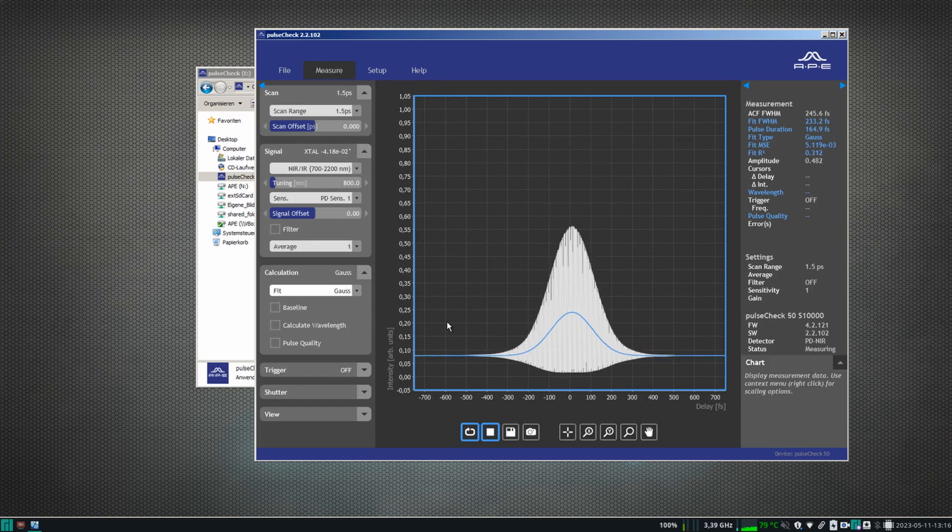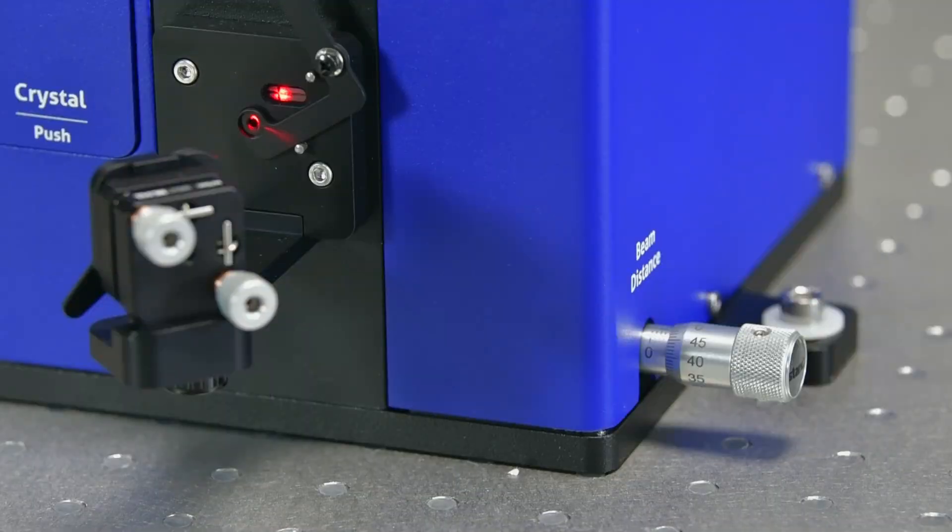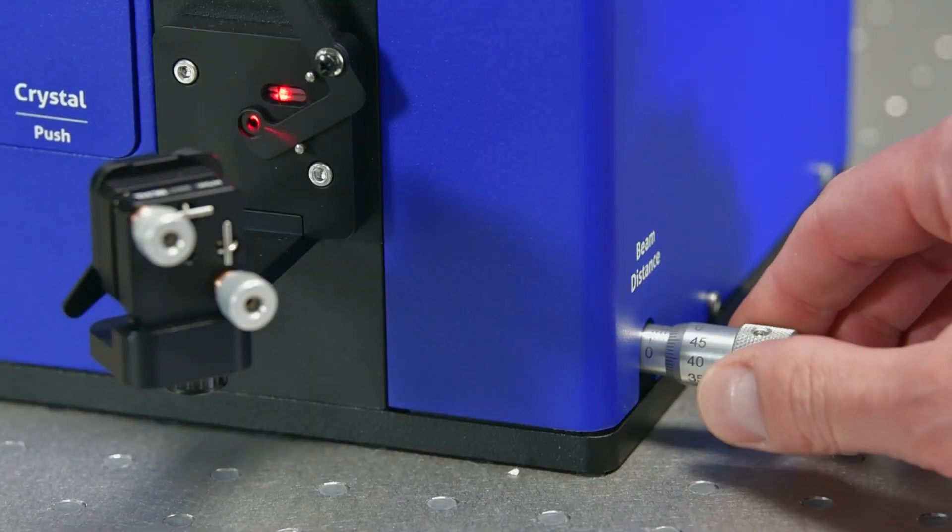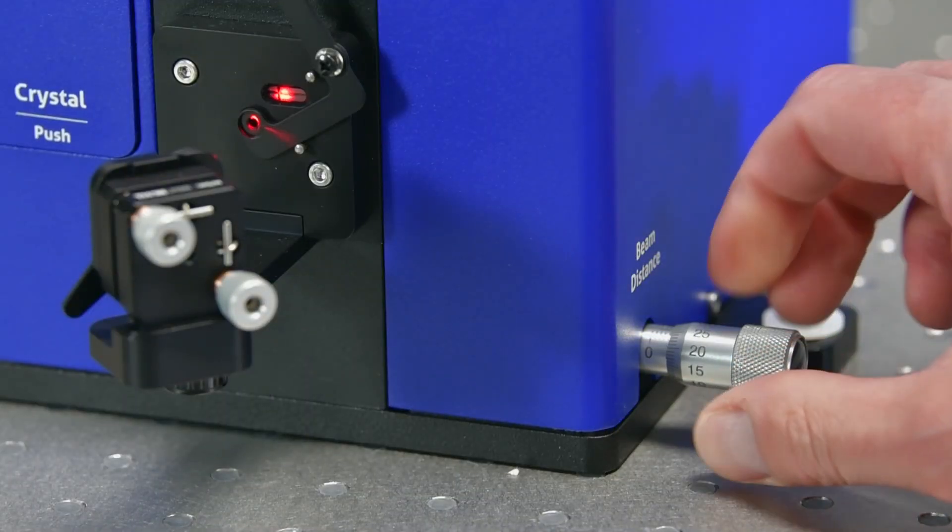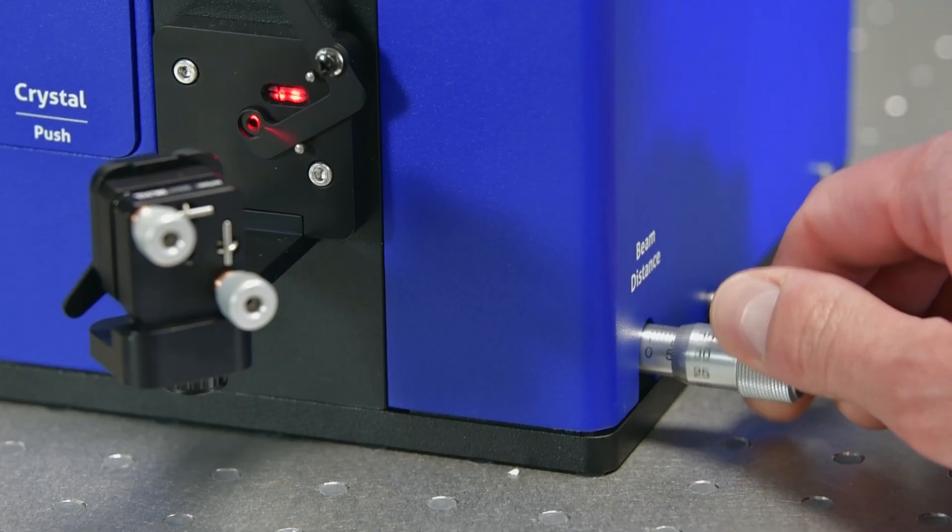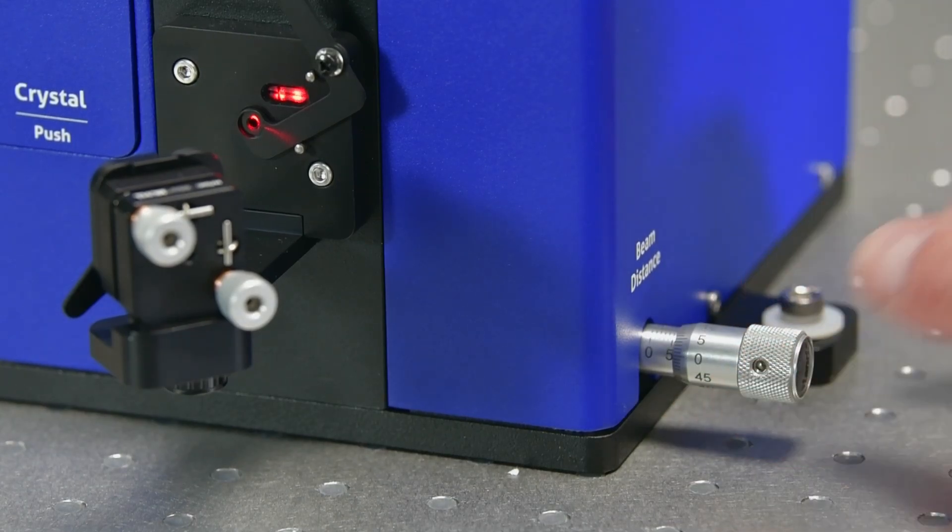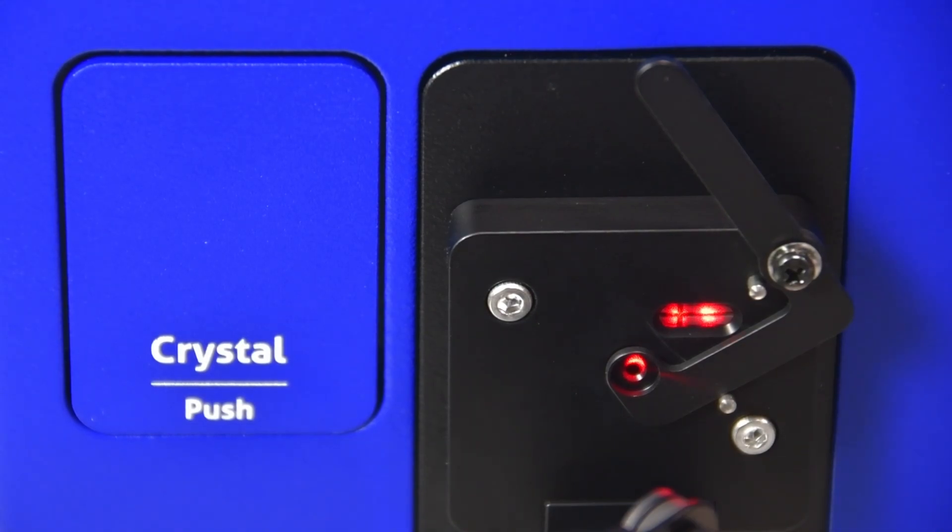If you want to change from collinear to non-collinear mode, simply turn the previously mentioned beam distance screw to the documented value. By adjusting the beam distance screw, you can always switch between non-collinear and collinear mode. In non-collinear mode, two separated beams are visible on the crosshair.